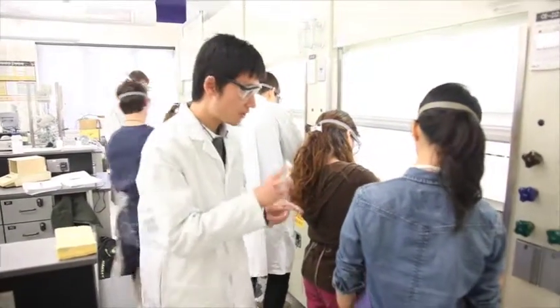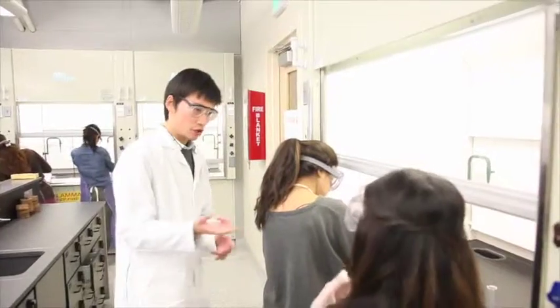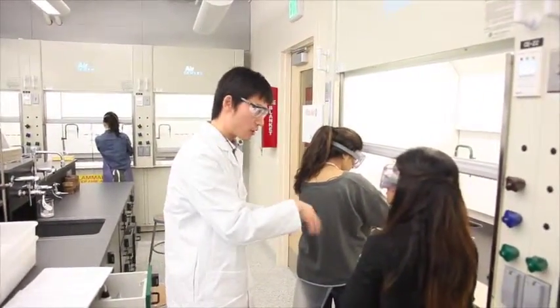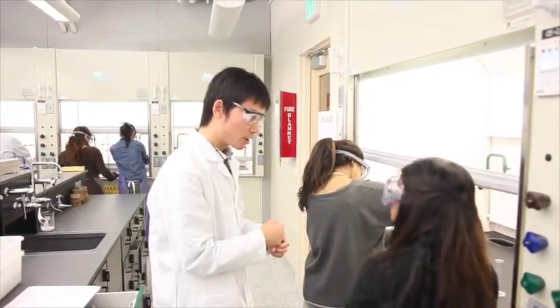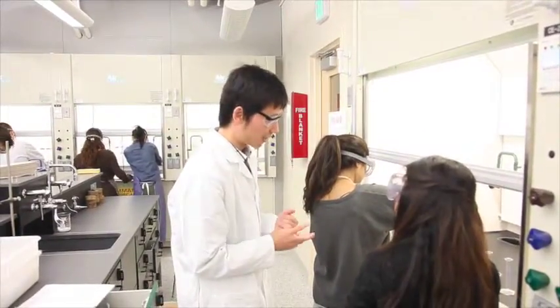Right, when scraping you have to make sure everything dissolves in solution. We will form the aqueous solutions. Because I said before that the compound is really sticky on the bottom, so you have to scratch it very hard. Eventually it will also dissolve in the solution. All of them will form a clear solution.